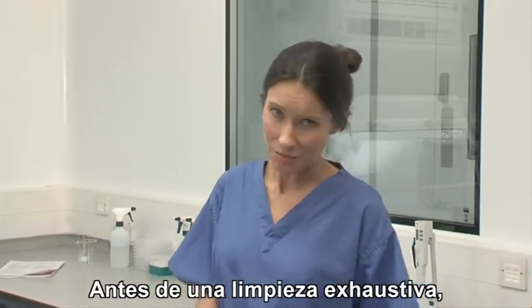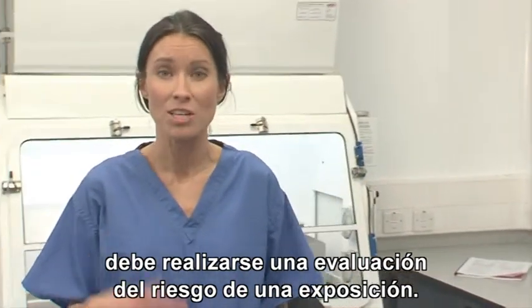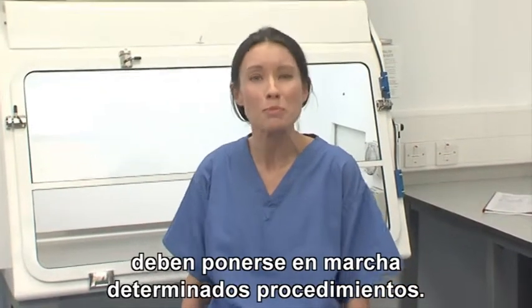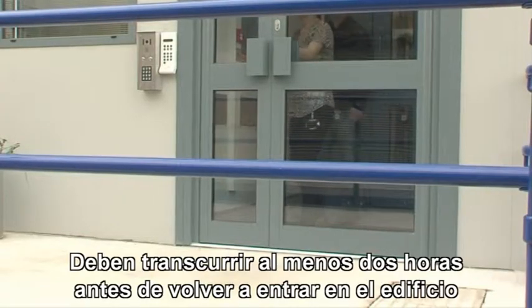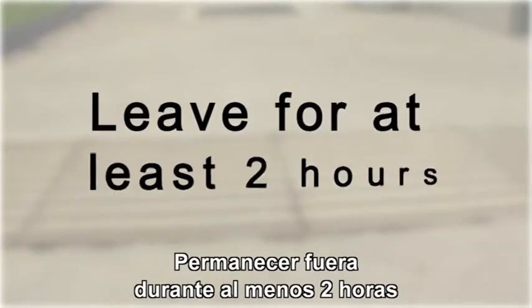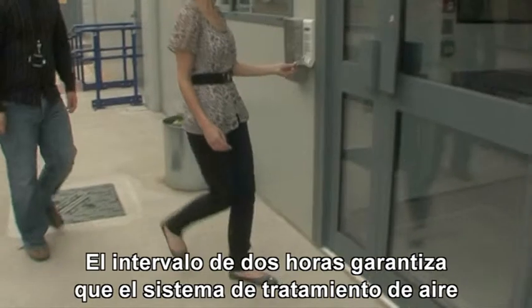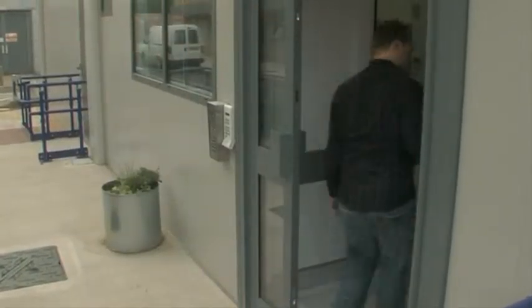Before a thorough clean-up can begin, a local assessment of the exposure risk needs to be made. Once that's completed and approved, certain procedures need to be put in place. At least 2 hours must elapse before re-entering the facility to treat and clean the spill. This 2-hour interval ensures that the air handling system should have removed any hazardous aerosols.